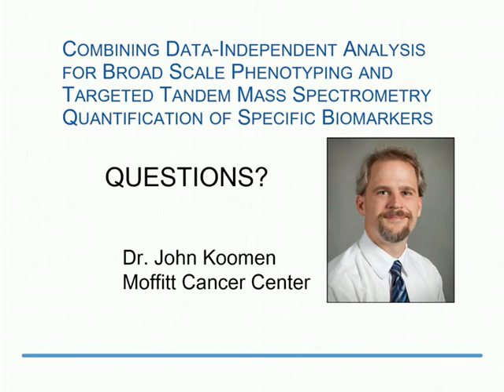Yeah, so I think that's probably the hot-button issue for a lot of people. Generally we feel that if we have a good match there, say really accurate mass measurement down to the PPM level for the intact peptide, and you have that same accuracy for your fragments, you're actually getting much higher quality and sometimes even higher content than people would get for a multiple reaction monitoring experiment.